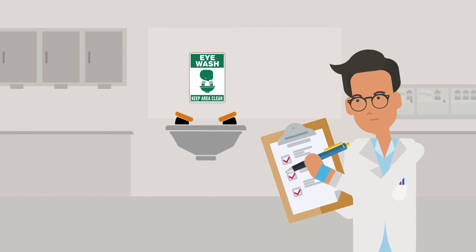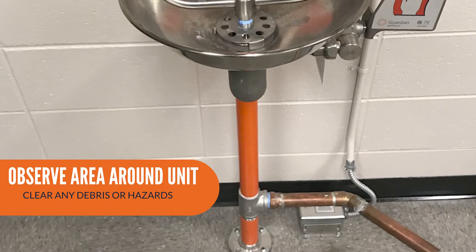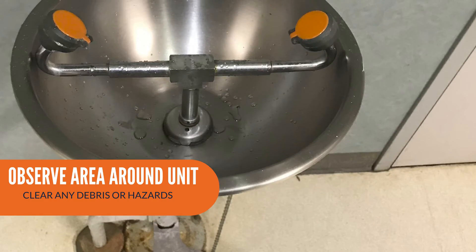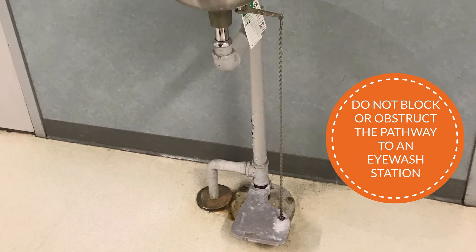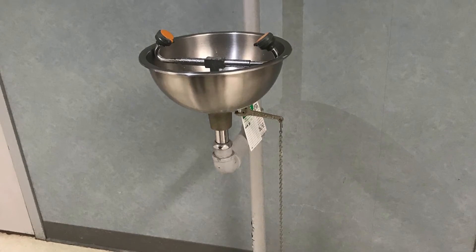Here's how to properly test your eyewash station and how to report any issues you may have. Before testing, observe the area surrounding the unit. Make sure the area is free from electrical hazards and any debris, and make sure there is a clear pathway to the unit. Do not block or obstruct the pathway to an eyewash station. If you encounter an obstruction, remove it immediately.